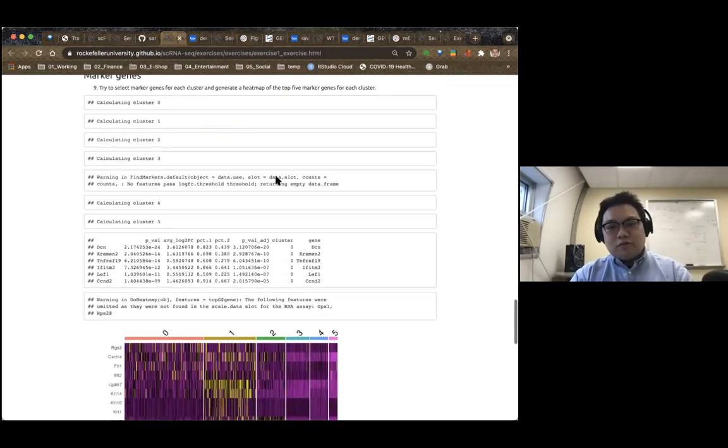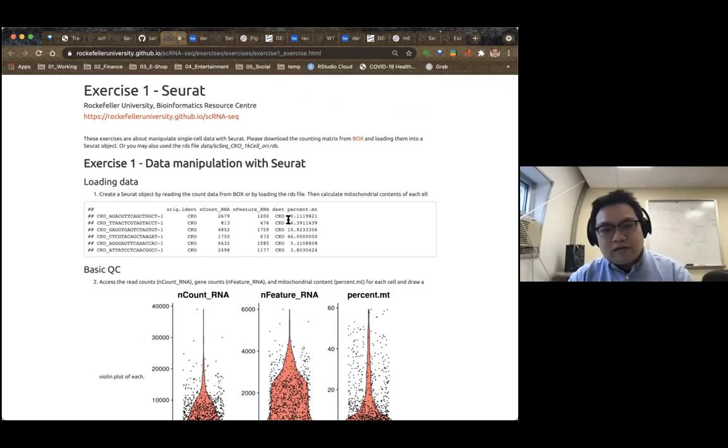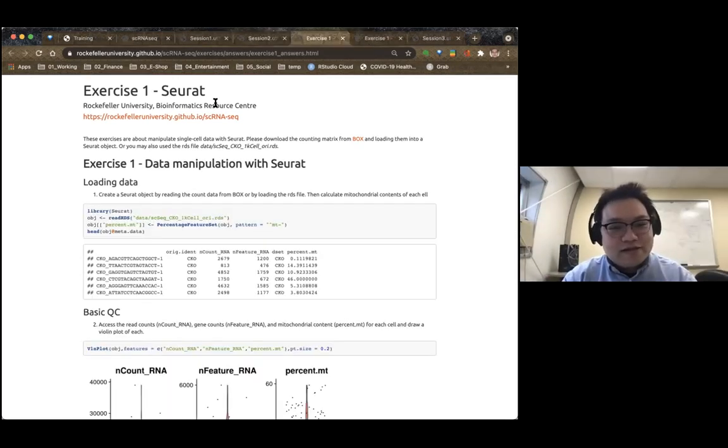Okay, right now it is 3 o'clock. We will spend 30 minutes to finish this exercise, and we will come back at 3:45, and we will have a discussion about this exercise and then enter the next section. Okay, let's start our exercise.